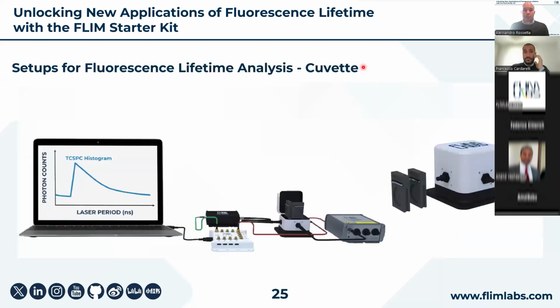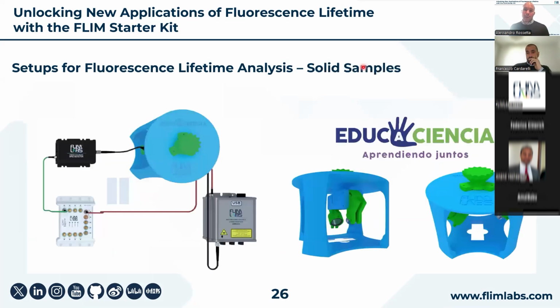Let me go on into our presentation, because recently we've been providing the FLIM kit coupled with two setups. One is a cuvette-based system, while the second setup we developed together with a Mexican company, Educaciencia, is meant for analyzing solid samples, contrarily to the cuvette where you would have liquid samples.